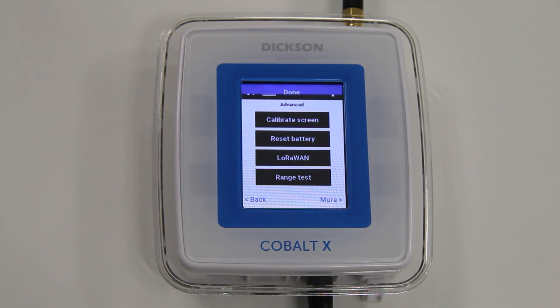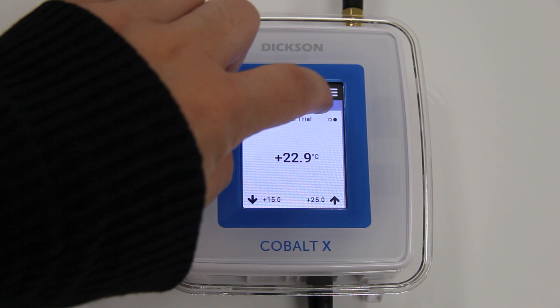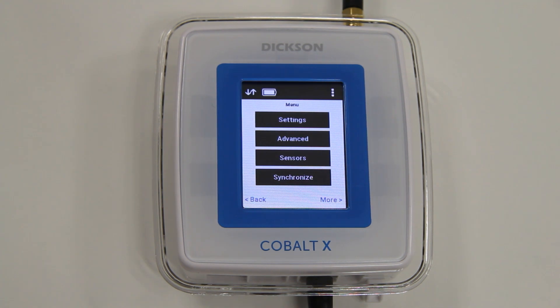Lastly, it is best practice to synchronize one last time to ensure data integrity. Press the menu icon and press the Synchronize button. Your data logger is ready to use and can be placed back into its original location.